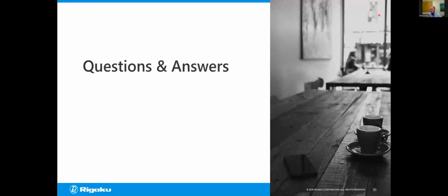So that's a combination of the cluster tool. As Tom was saying, it's a machine learning tool that separates out powder patterns to identify which are the same and which are different. And then from that, you can construct your own standards as well. So there really are many ways of identifying components that you want to call a standard.